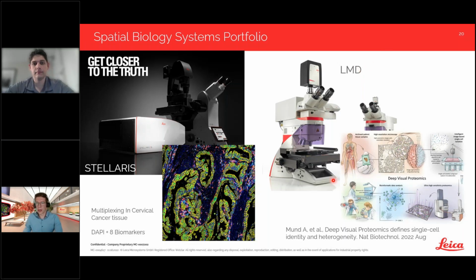And there was, two years ago, a very widely cited publication which used a whole workflow starting from a tissue section taken from patients, imaging this with a wide field microscope, for example, Mica, running deep visual proteomics, so image analysis on those images, and then deciding which are the interesting cells that we want to further analyze, which are the cancerous cells in this tissue, taking then the sample to our LMD, which is then able to precisely, with a laser, cut out the cells that you want to analyze and collect them just by gravity.